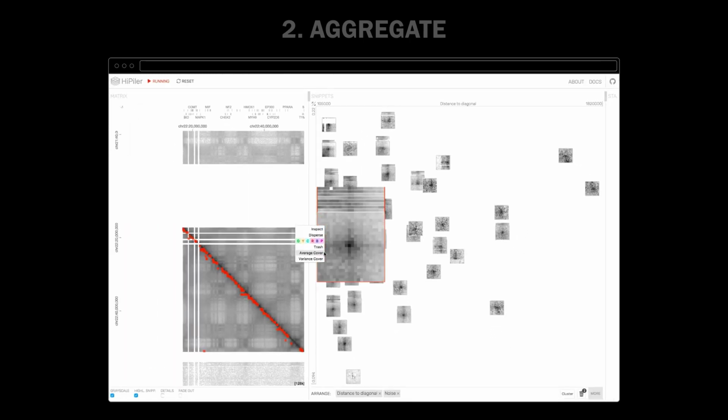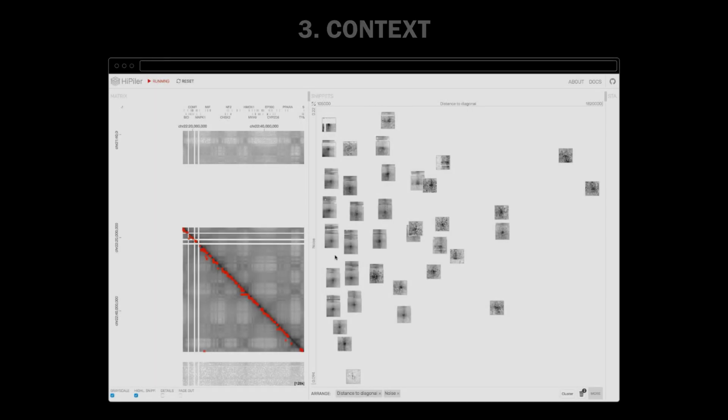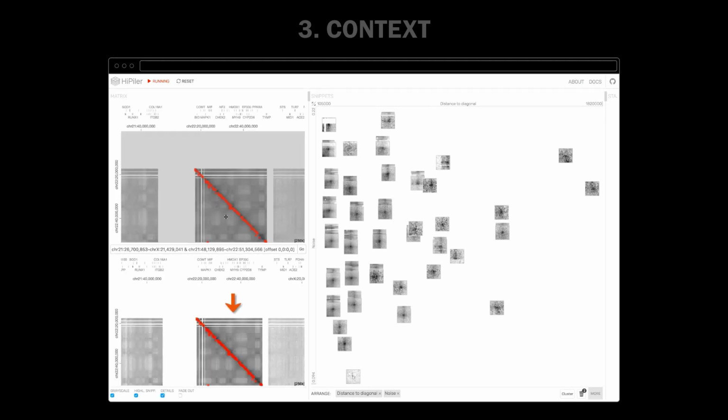Okay. So that's that. And now we can also understand context. Again, very important. We look at some very local patterns, but in order to interpret them, we might want to know where they are. And that's our context view over here, the global overview. So now we have an overview and a detail view, that's a smaller area down here. And now we can actually see where these things are mapped. So this is over here, these are down there.